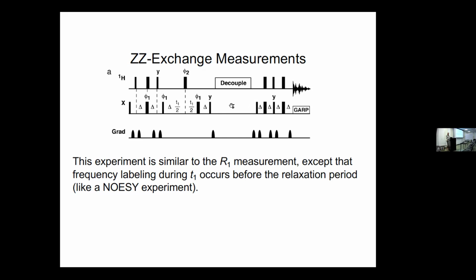In this sequence, if you mean during capital T, you would like to have only exchange and not relaxation. Yes.